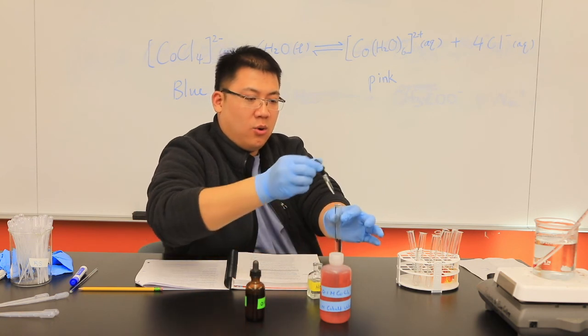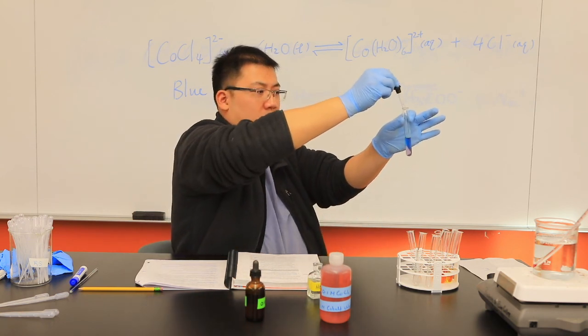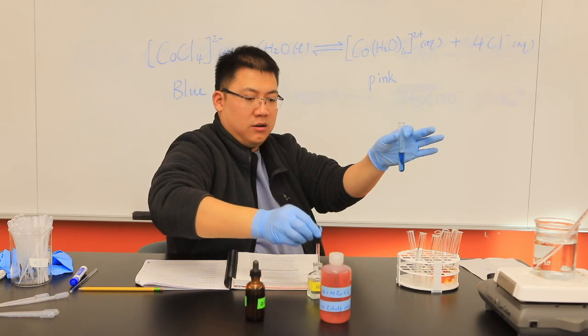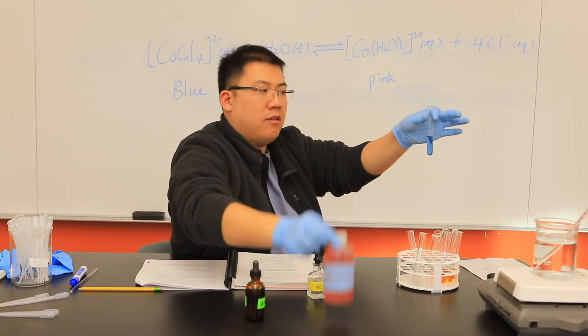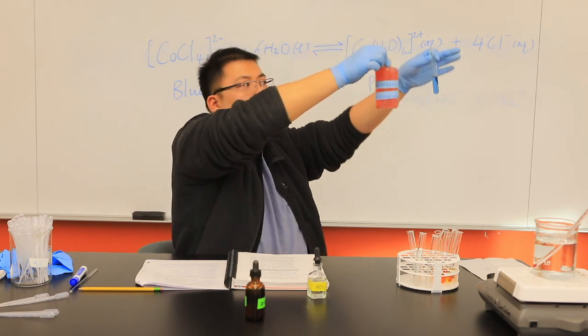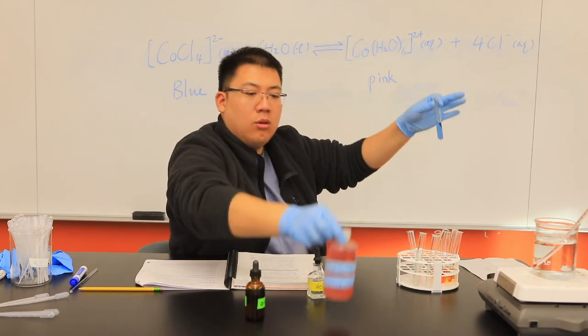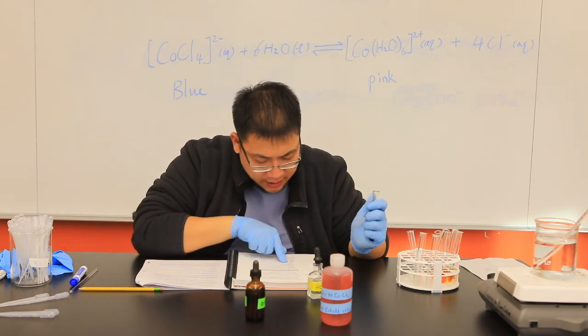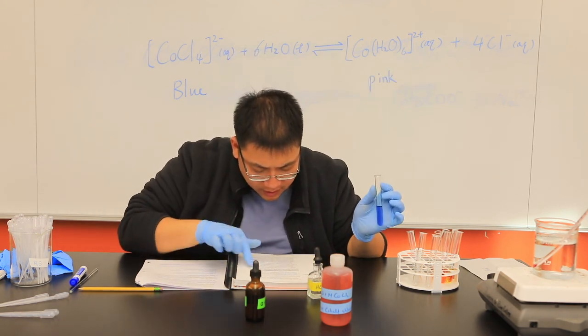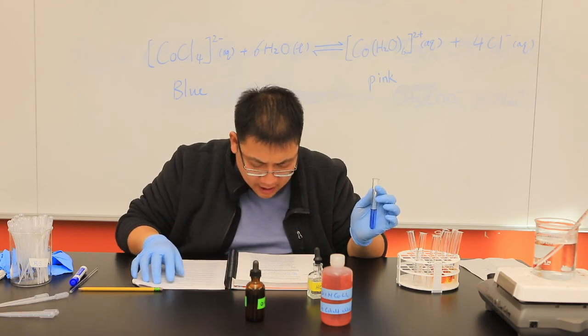It's going towards the blue color, right? If you compare them, this is the pink, and then this is the blue. Okay. All right. Record this into line 18 of the data sheet.